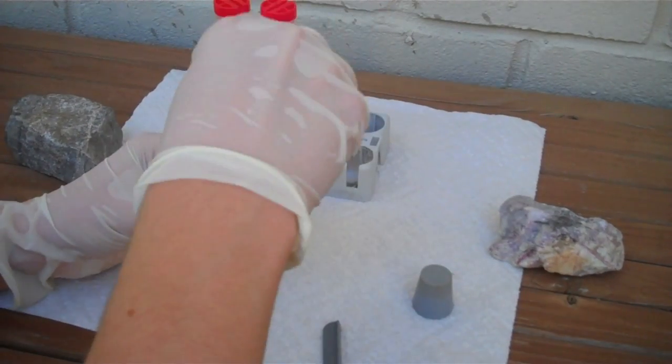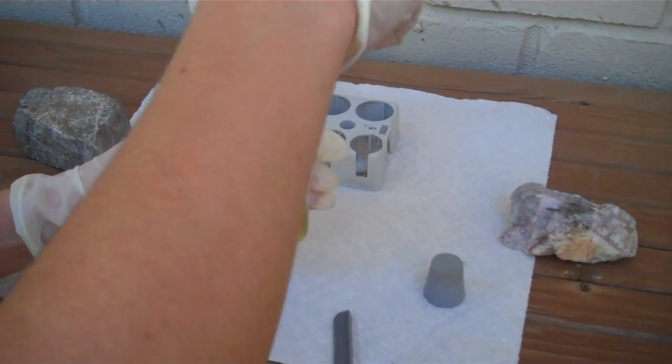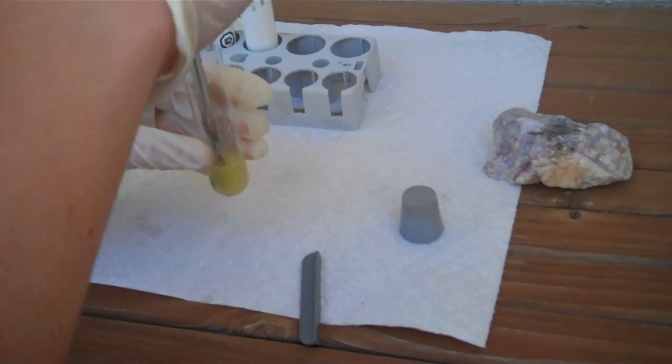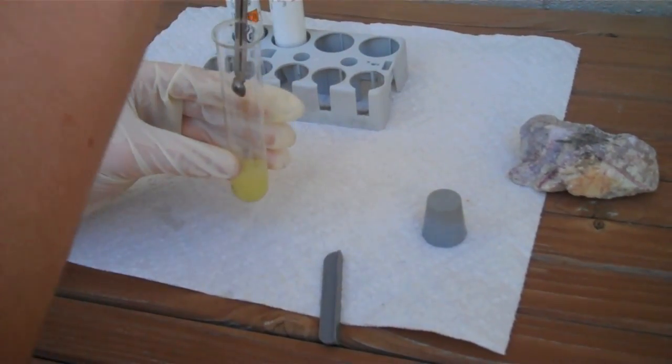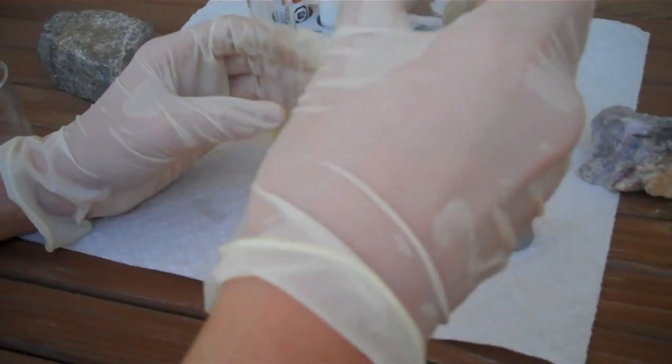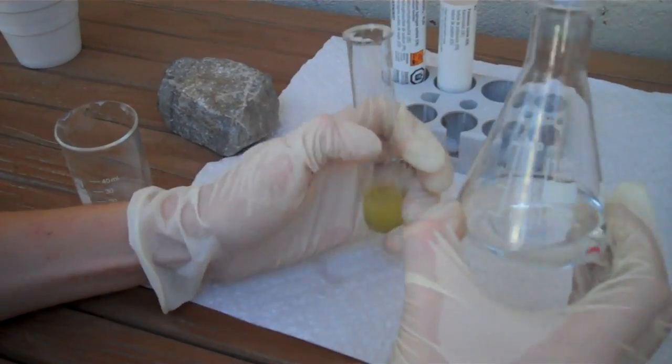So you can see the solution is yellow. I'm not sure why it turned yellow. It should still be clear, but it's okay if it does turn yellow when you're doing this. Now add a small amount of hydrogen peroxide.